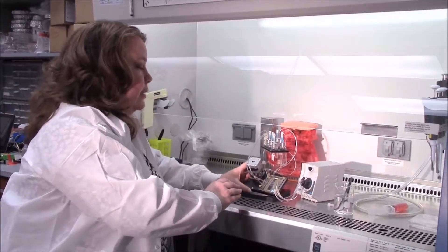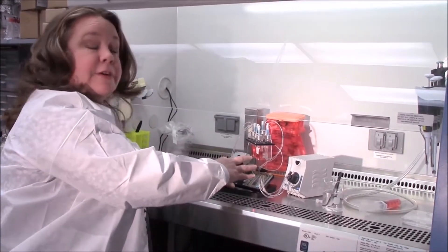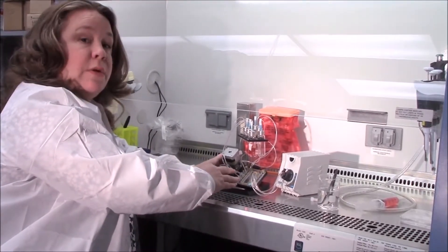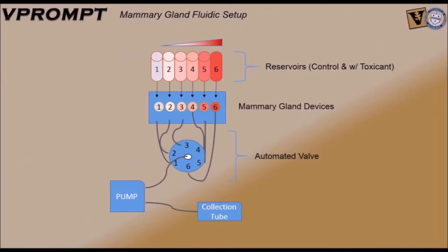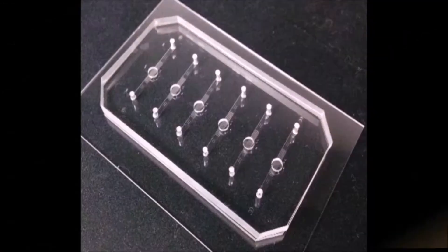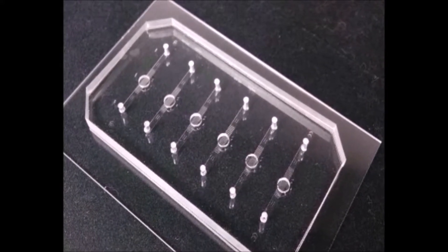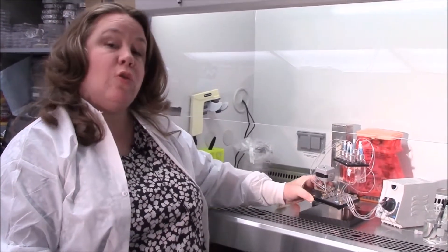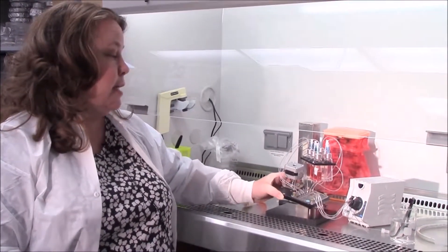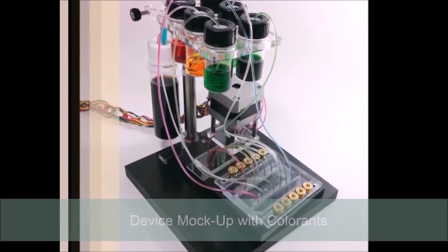The latest design is an improvement on our earlier ones because now we can provide six different conditions all on the same chip, making it a little bit higher throughput. This means we can provide, say, five different doses of a toxicant. We have oxygen-CO2 balance, and the cells are all plated at the same time so we can do direct comparisons — everything in a compact system controlled with its own pump that we can easily insert into any microscope that can take a 96-well plate format.